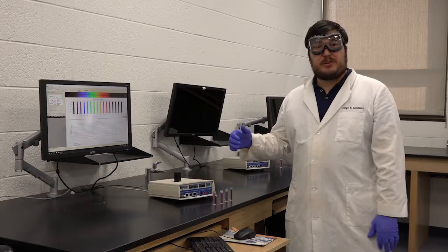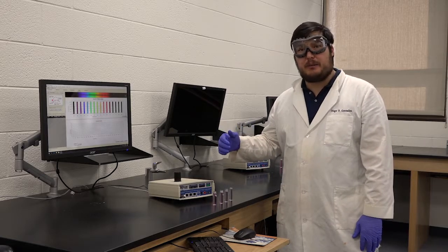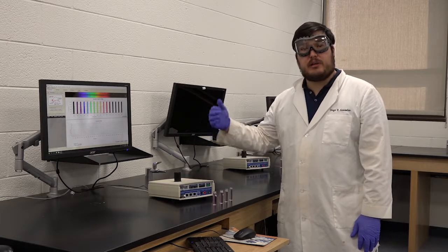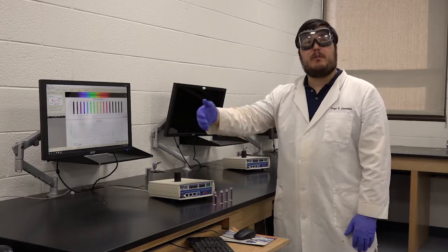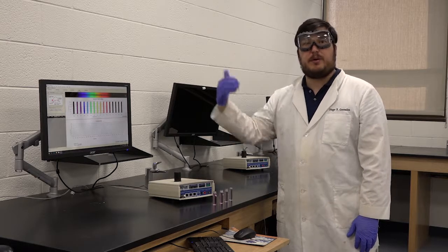So now that we've finished with the calibration of our spectrophotometer, we can go ahead and add our pink potassium permanganate samples from concentrations of low to high. We start from low to high because this allows the instrument to read the values correctly. If we go from high to low, sometimes the instrument won't be able to read the values between samples as accurately as if we go from low to high.